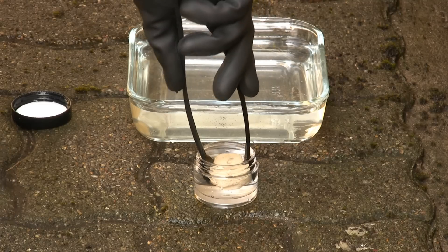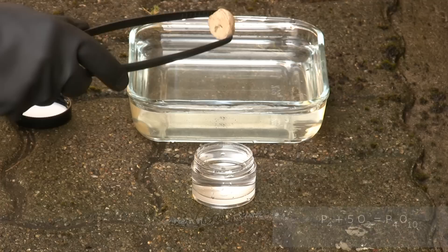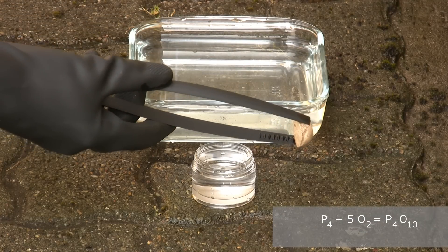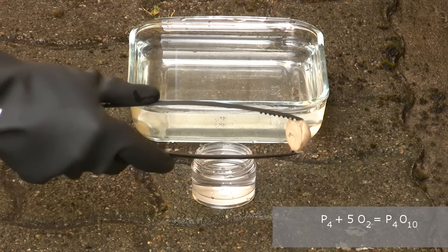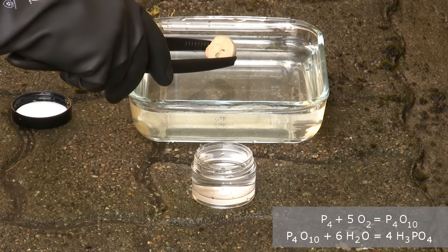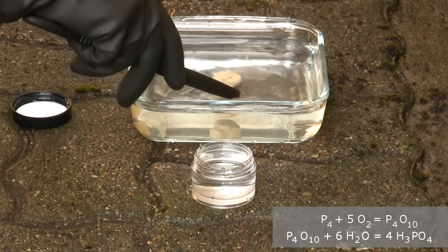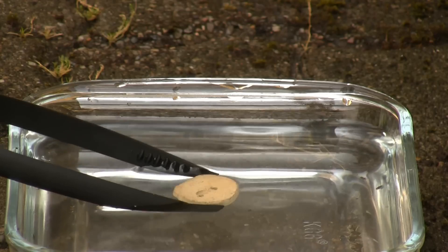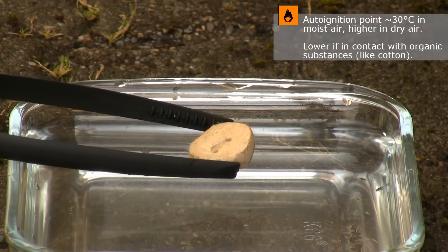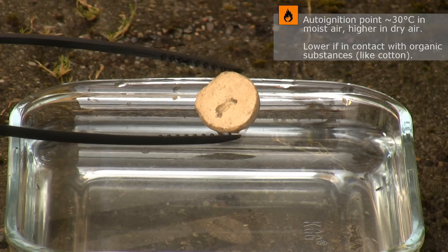Here it is — 12 grams of white phosphorus. Even when wet it starts reacting only a few seconds after it is out of the water. You should be able to see some fumes coming from the sample. Don't breathe this. It turns into phosphoric acid with the moisture inside you. Here's a closer look. A large sample like this will not ignite quickly unless the air is hot. I still hold it above some water though because it is rather unpredictable.